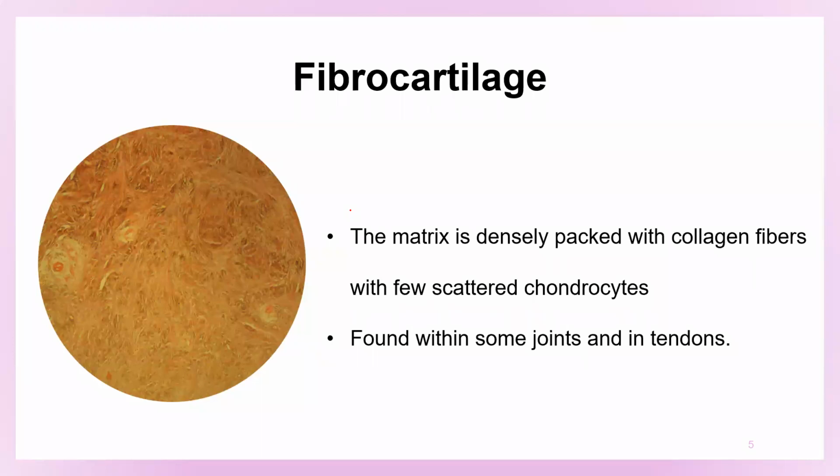However, I have shown you pictures which are much better than the slide that we have. This is the picture of the slide we have, but you have seen pictures of slides which have been taken from the net. So in the lecture, you saw better pictures of fibrocartilages. Sometimes the chondrocytes may be arranged in the lines of stress. Even the collagen fibers are arranged in the line of stress, though it is not visible in this slide.